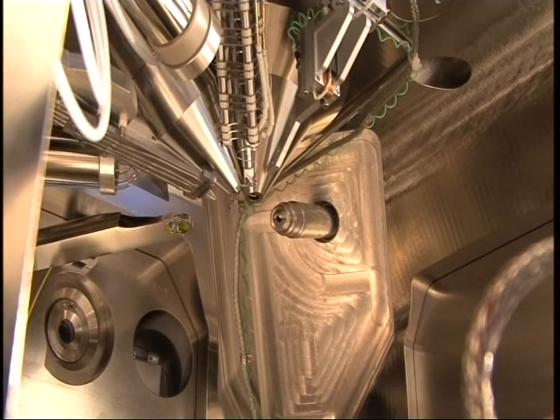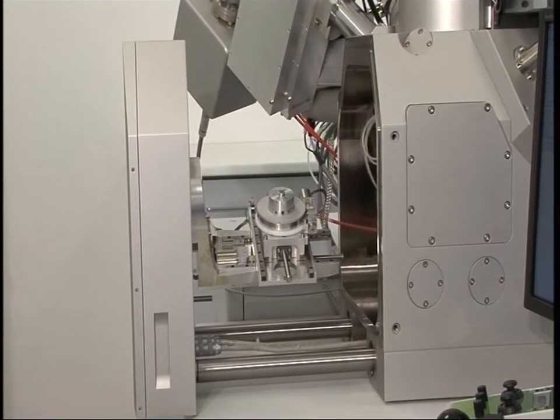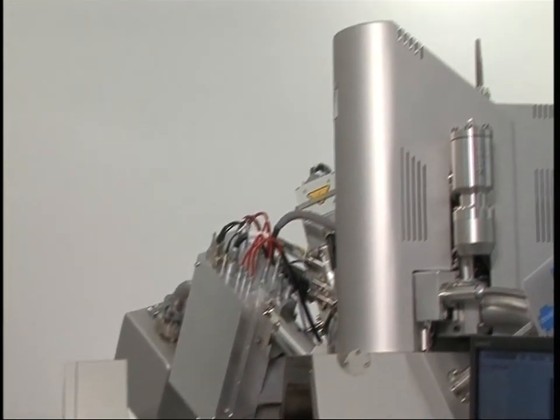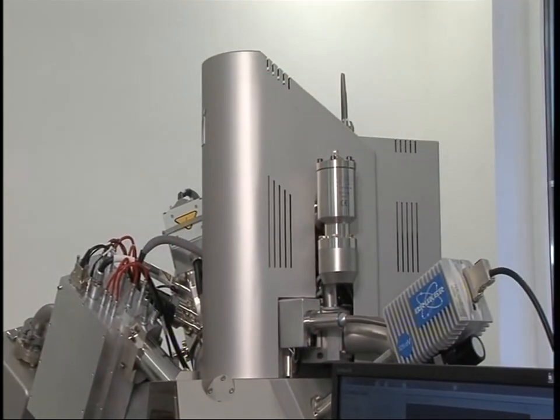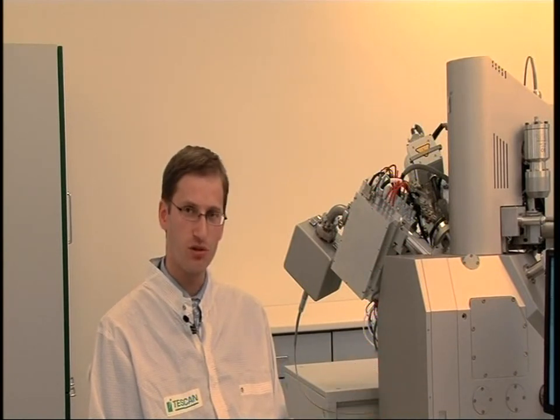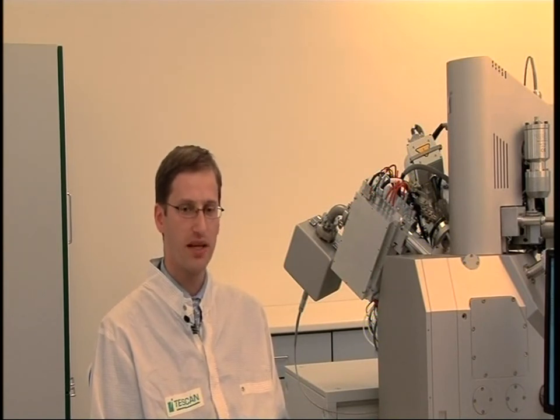This multifunctional device allows for imaging, analysis, manipulation, and modification of the sample all within a single apparatus. As a result, the user does not lose the cleanness of the sample when transferring it between various devices. The sample is not subject to contamination, oxidation, and so on.